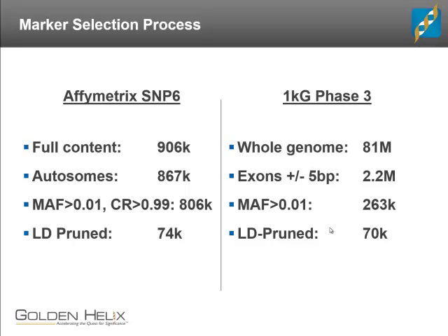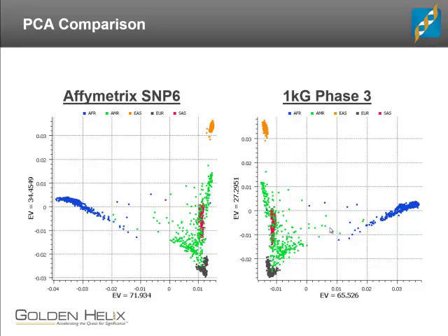But if you take those two sets and run them both through principal components analysis, the result is stunningly similar, at least in the first two components. What you should see here is essentially a reflection where the first two principal components based on the SNP data or based on exon data, it's pretty much identical.